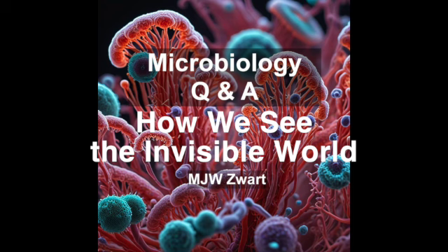Exactly. What about SEM? SEM works a bit differently. Instead of transmitting electrons through the sample, we scan a focused beam of electrons across its surface. I see. The electrons interact with the sample's surface, producing signals that are then used to create a 3D image. Oh, cool. So with SEM, we get a 3D view. A highly detailed, three-dimensional view of the surface of an object. It's like exploring a tiny alien landscape.